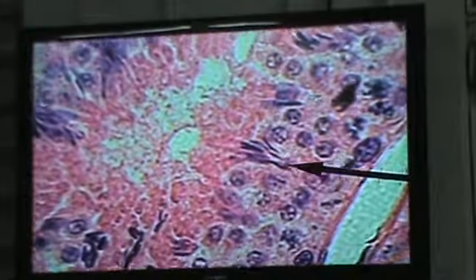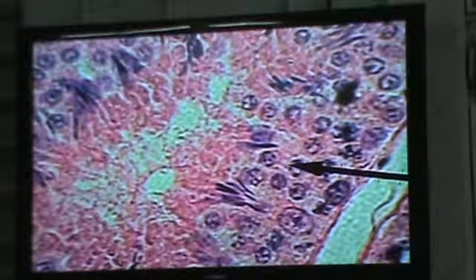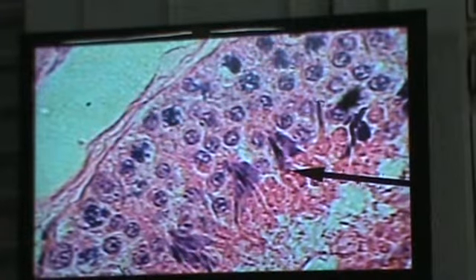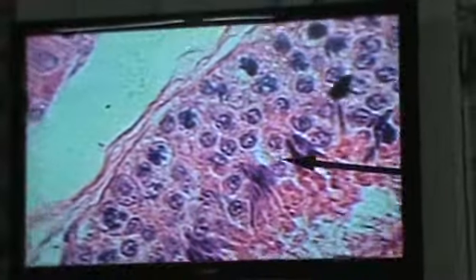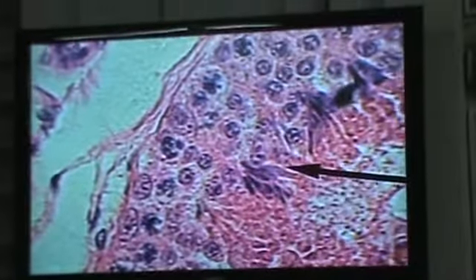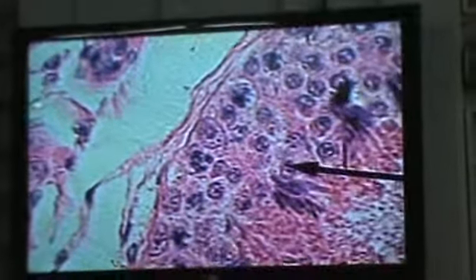Okay? So these are the Sertoli cells. They're very important in the blood testis barrier. So there are compartments. There are more Sertoli cells. You can see they're all coming to a point where they're bubble. That's another nice one. See one right there? So right there, trace them right out.